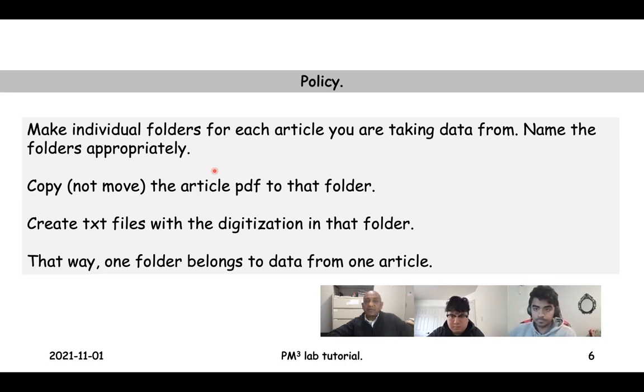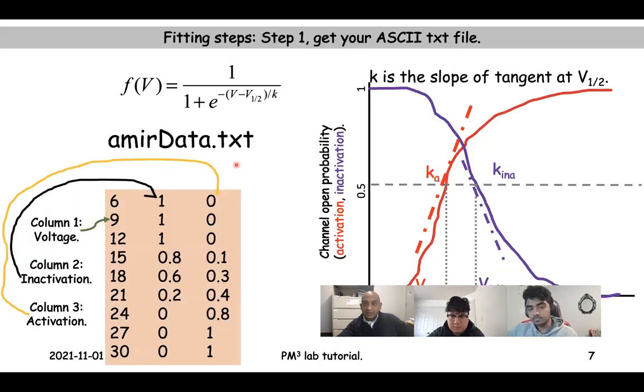So both Amir and Abdus are going to do their own presentations in a minute. So let's proceed to the next slide, which is step number 1. And step number 1 is just to get your data file, ASCII data file, in order.